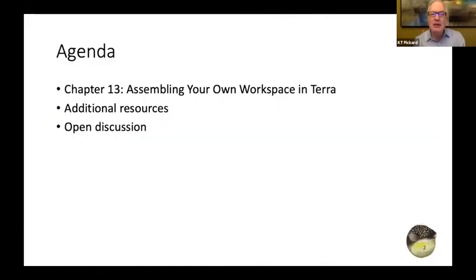In today's meeting, we'll be covering Chapter 13, Assembling Your Own Workspace in Terra. We'll be building on information we learned in Chapter 11, except this time making it your own, or what I like to call terraforming. We have a guest speaker presenting this information today. We'll follow our usual format with additional resources and an open discussion at the end.